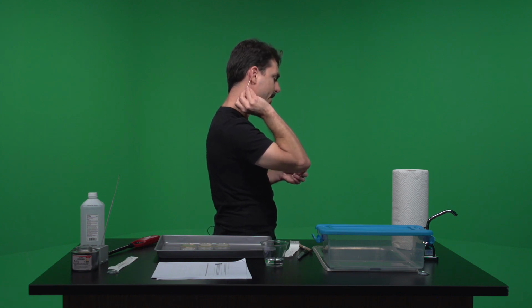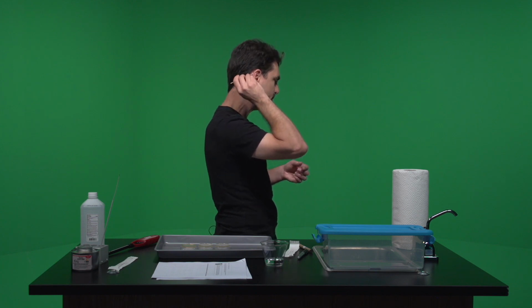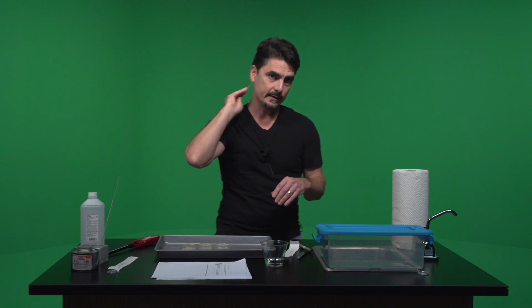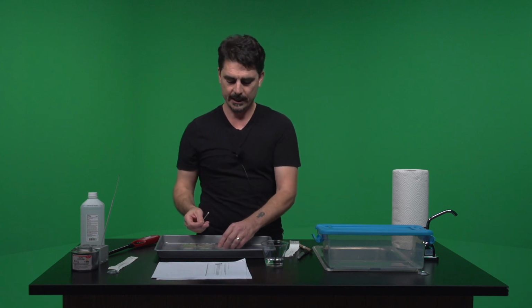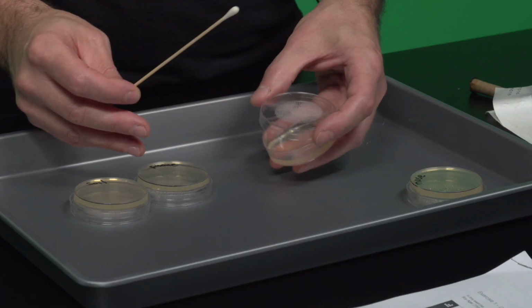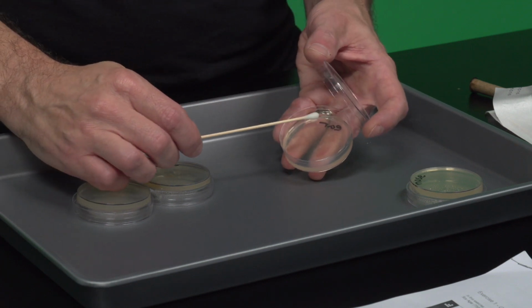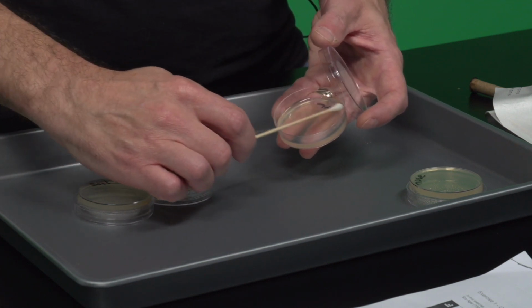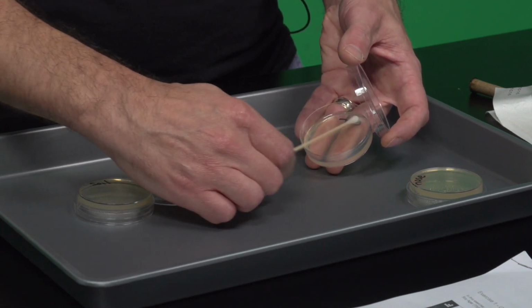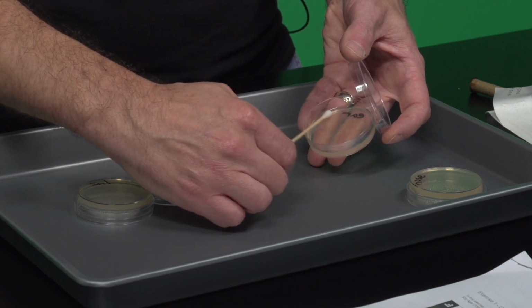Another consideration, whenever you're choosing the portion of your body, don't have it be a portion that you cleaned just recently. So I wouldn't want to do my hands because I washed them really well before I started, okay? So again, for the ear then, we could do it the same way, where we open up and we have that little barrier, right? And essentially what we're doing then is moving it back and forth, twirling it around. And so that essentially is our quadrant 1.